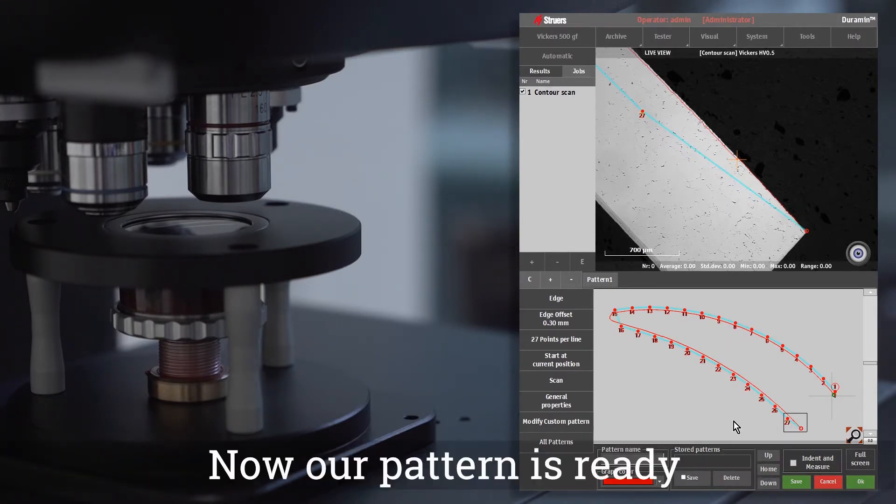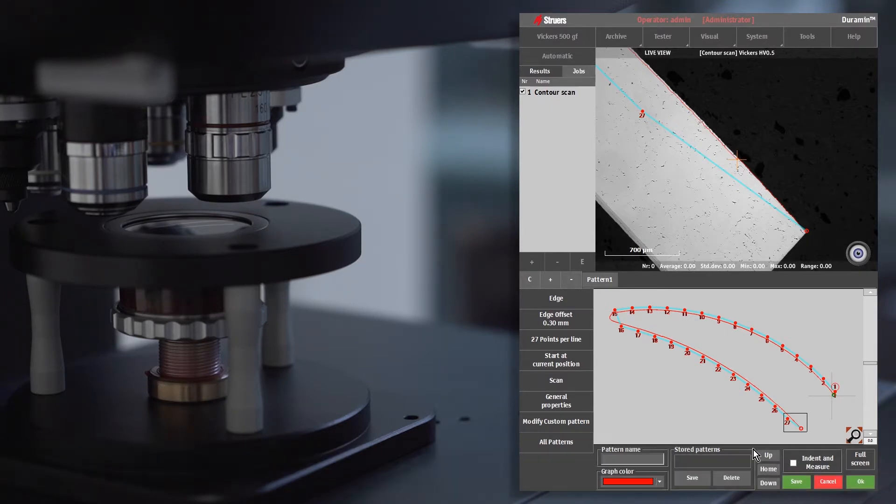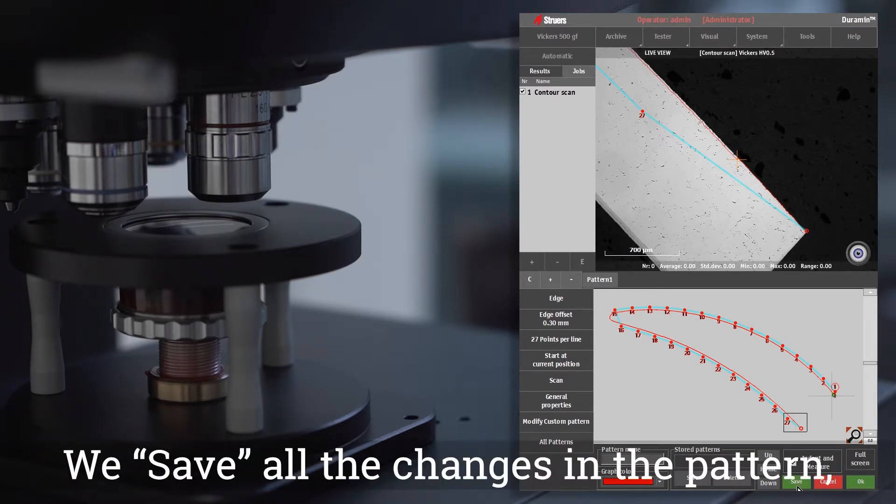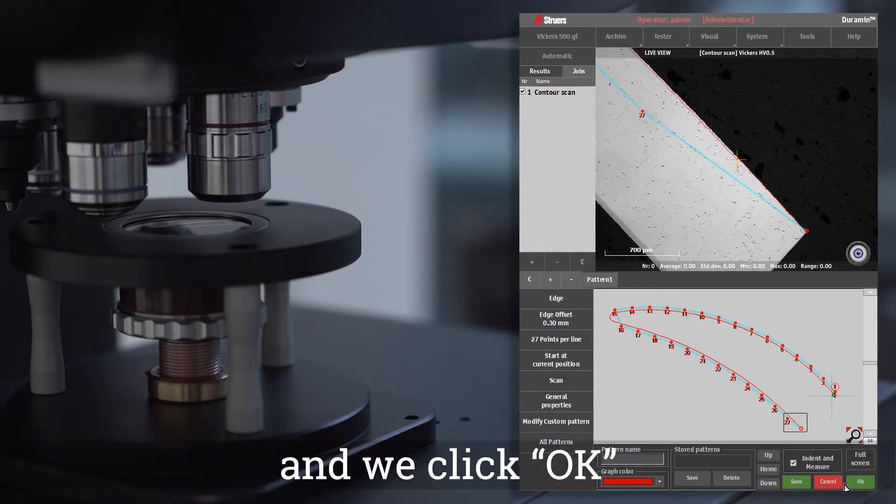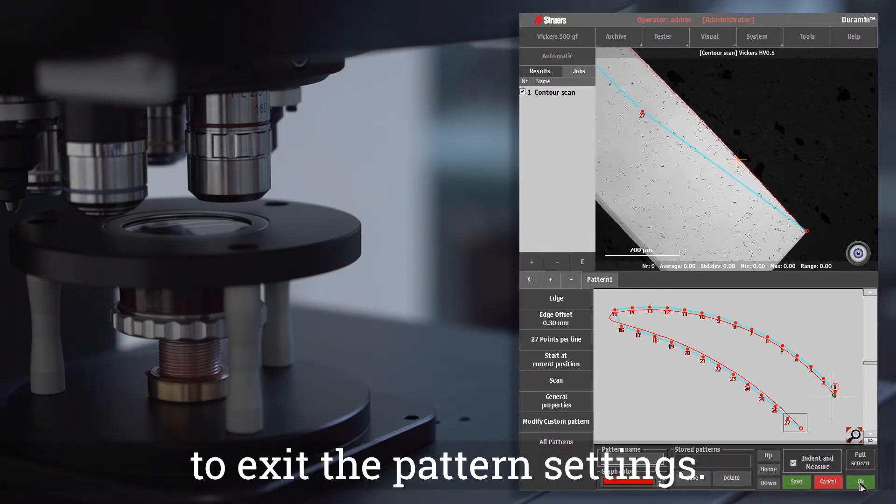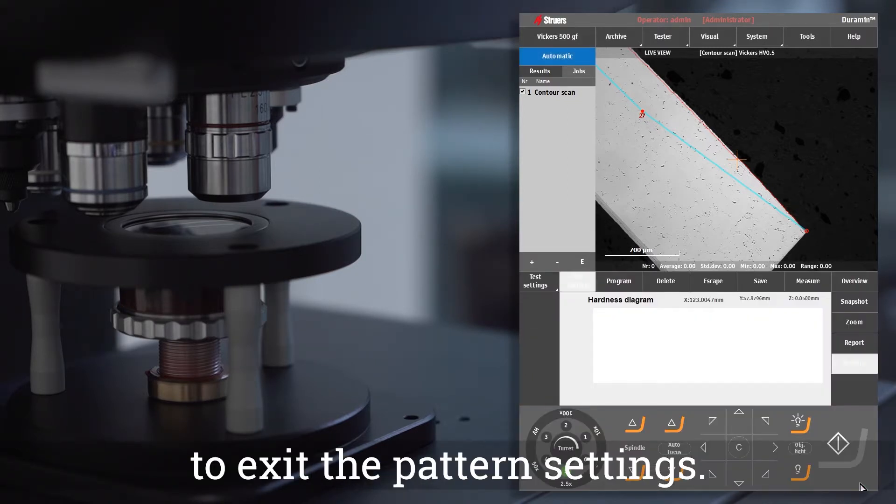Now our pattern is ready. We save all the changes in the pattern, and we click OK to exit the pattern settings.